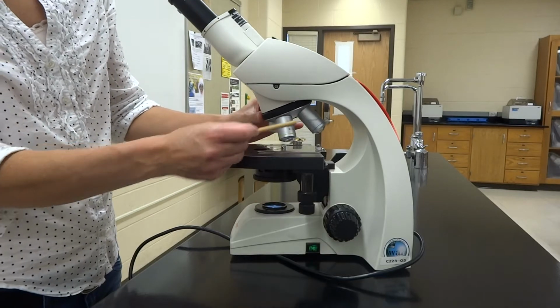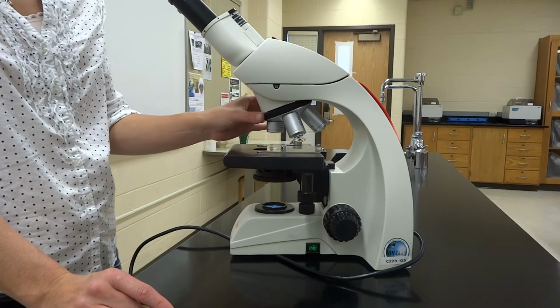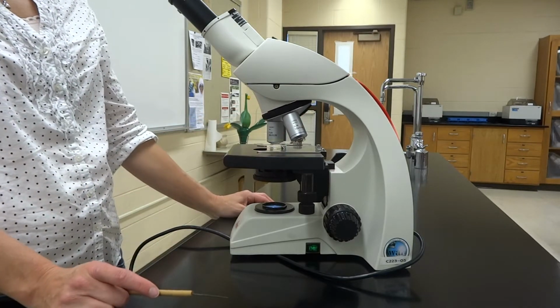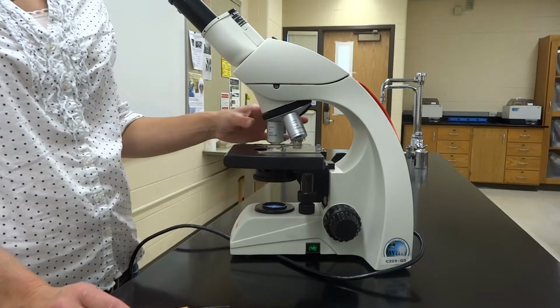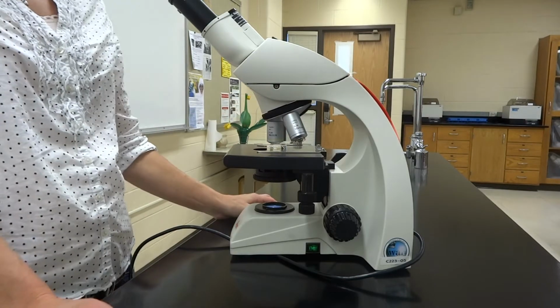Now, because our microscope is parfocaled and par-centered, we can just move that 10x over, and you should be able to see your specimen. And keep in mind, what do we not want to grab when we are shifting? Don't want to touch the lens itself. We don't want to crank on the objectives.